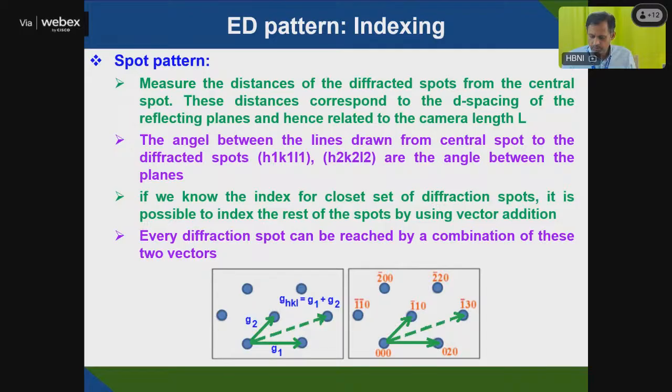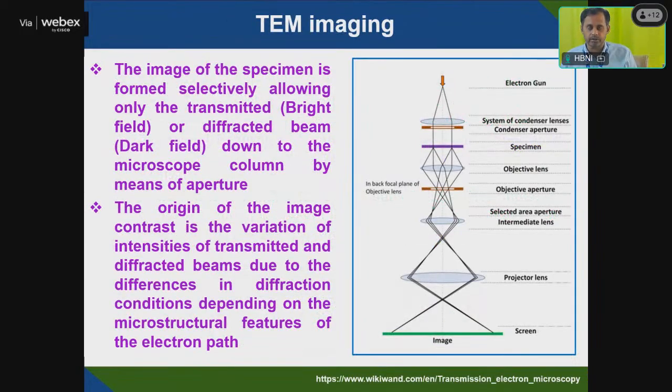Okay, so far we have discussed how the electron diffraction pattern helps in interpreting information and what information we can get. Mostly, from the electron diffraction pattern we can tell whether my material is amorphous or crystalline, and if crystalline, whether it is a single crystal or polycrystalline material. Then you can identify each plane, and based on that interpret the crystal structure and whether the phase has formed or not.